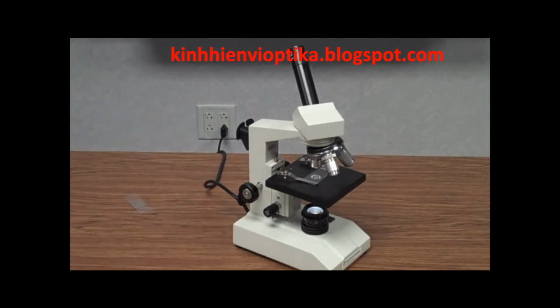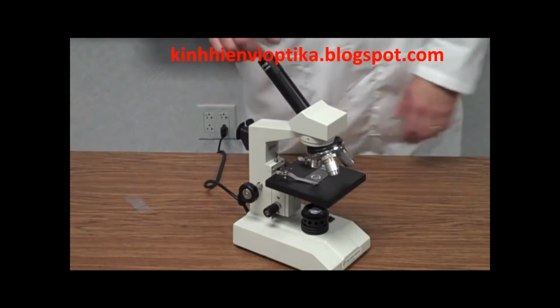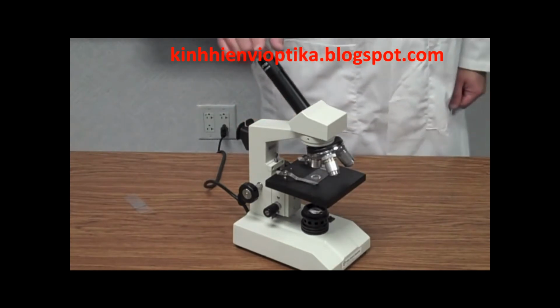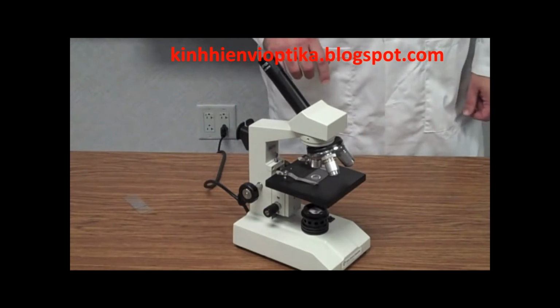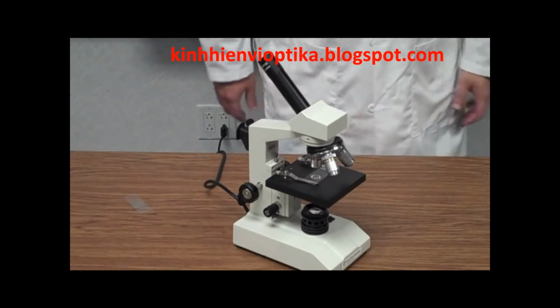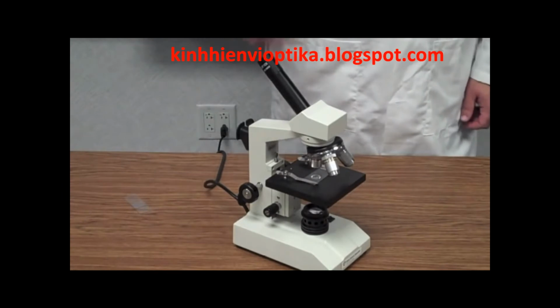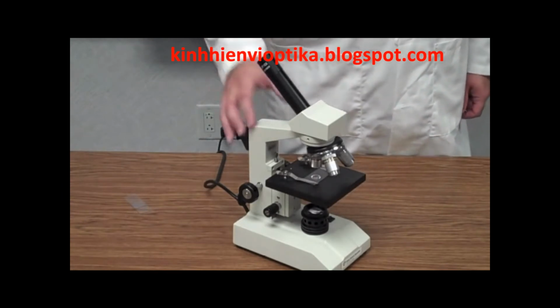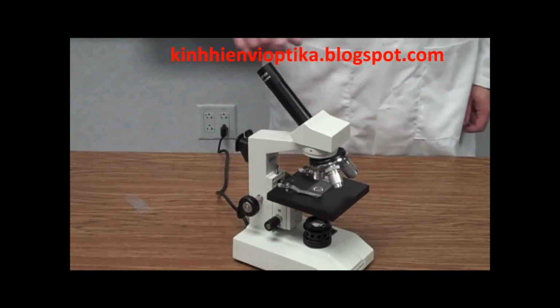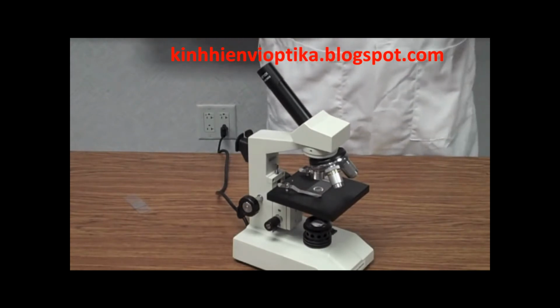Okay. First thing, we'll start here at the top, and then we'll work our way on down to the bottom. The first part of this is the eyepiece. This is where you look through to see the image that is being displayed on the stage. Whatever you're trying to see, whether it's a cell or something very, very small, you're going to look through this particular part called the eyepiece. This is also the first place that the image is magnified. The image is magnified 10 times right here at the eyepiece. So immediately the image is 10 times larger than it is just looking with your normal eyes.